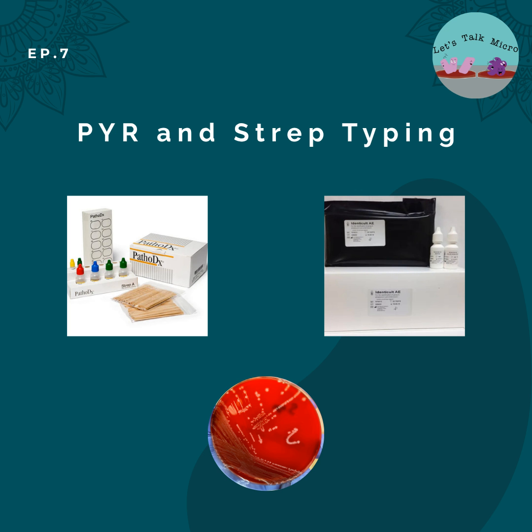That way you're aware that while you have growth there, you might not be able to test it right away. You might have to sub it to a blood plate. So you find yourself in a situation where you're like, oh, look at beta hemolytic colonies, let me do a typing. And you might get some agglutination. There was a case years ago where a tech saw beta hemolytic colonies on a PEA plate. They did the typing, and it was positive for B.